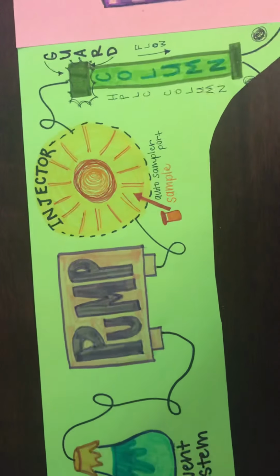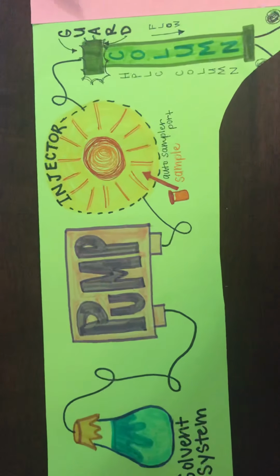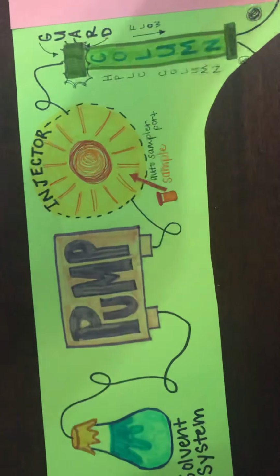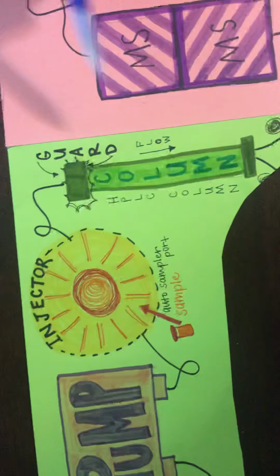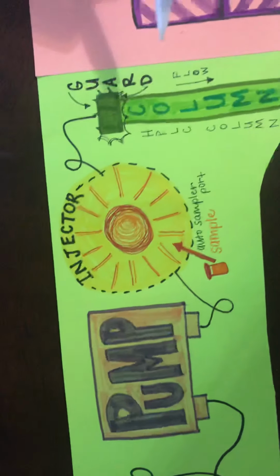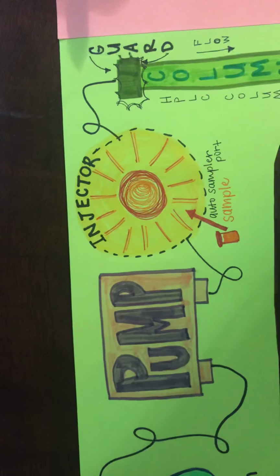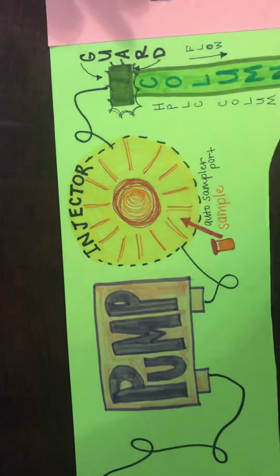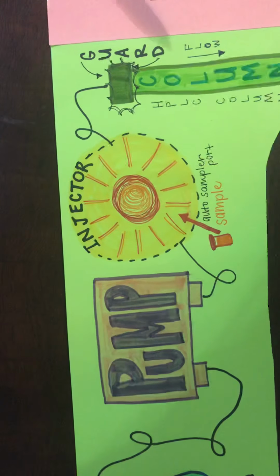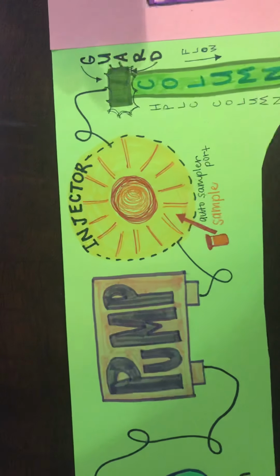And so with a column that is packed with beads that have various compounds attached to them, based on the polarity that we want for the analyte that we're using. And so the most common beads that are used in our packed columns are the carbon 18, which are nonpolar, and that's for the stationary phase, which means that the beads have 18 carbon chains attached to them, an 18 carbon chain attached to them.